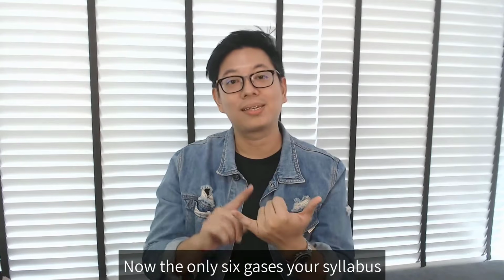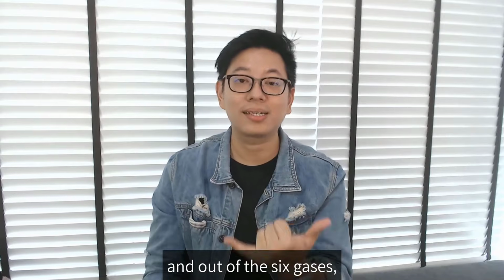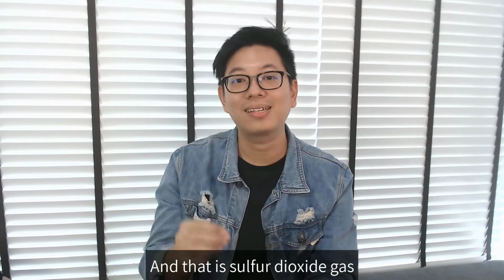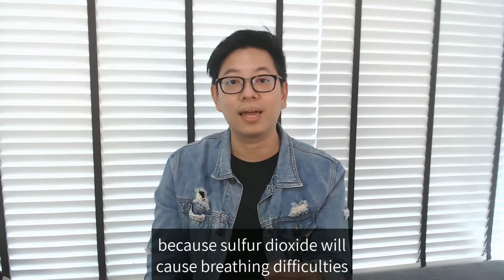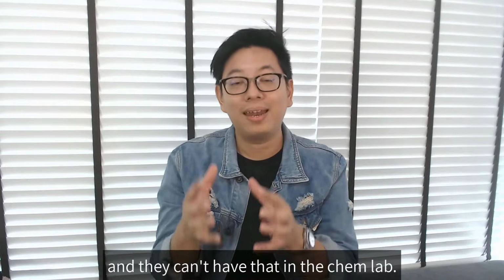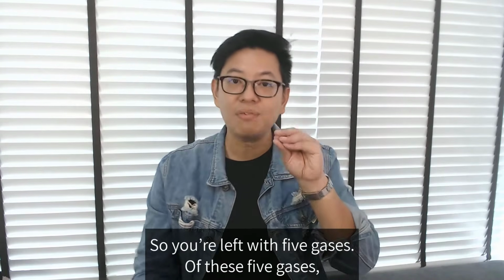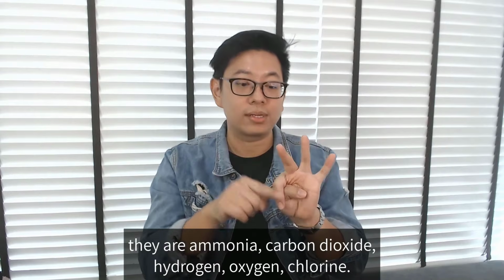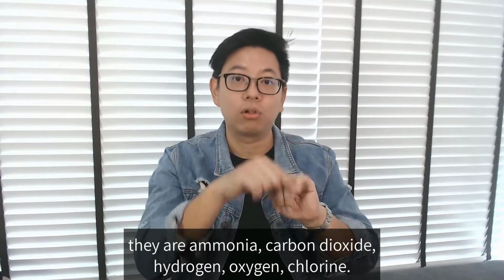Now there are only 6 gases in your syllabus, and out of the 6 gases, one of them will not appear for your O-level practical exam, and that is sulfur dioxide gas, because sulfur dioxide may cause breathing difficulties, and they can't have that in the chem lab. So you're left with 5 gases. Of these 5 gases, they are ammonia, carbon dioxide, hydrogen, oxygen, and chlorine.